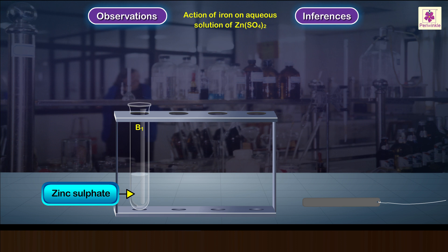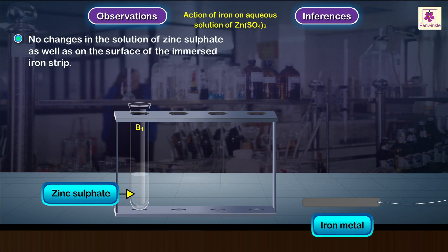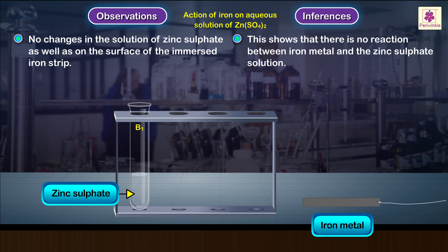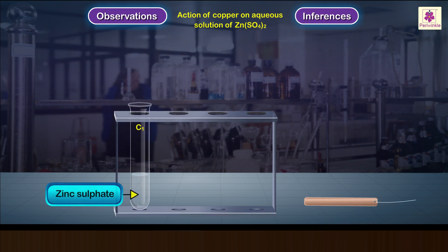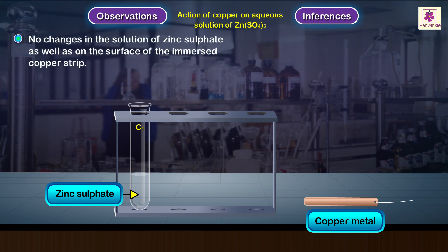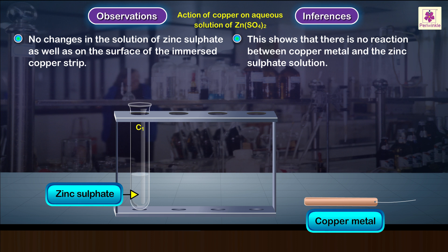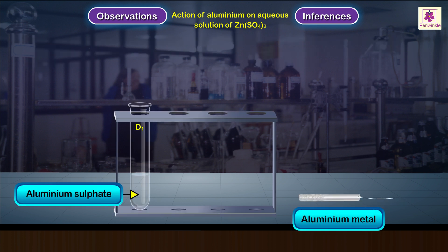Test tube B1 containing iron metal: no changes in the solution of zinc sulfate, and no changes on the surface of the immersed iron strip. This shows that there is no reaction between iron metal and the zinc sulfate solution. Test tube C1 containing copper metal: no changes in the solution of zinc sulfate, and no changes on the surface of the immersed copper strip. This shows that there is no reaction between copper metal and the zinc sulfate solution.